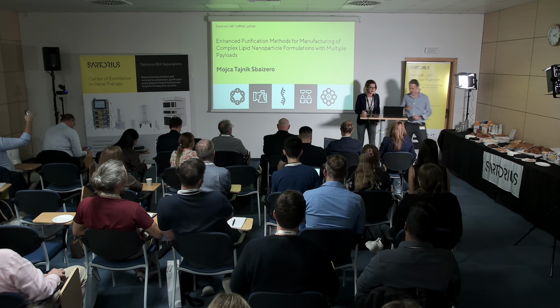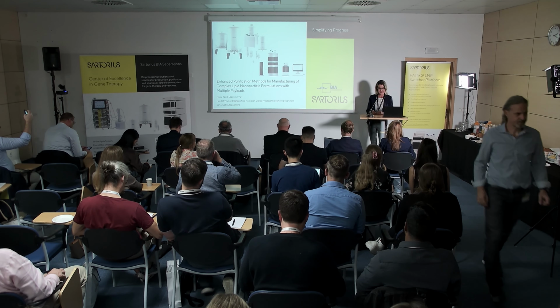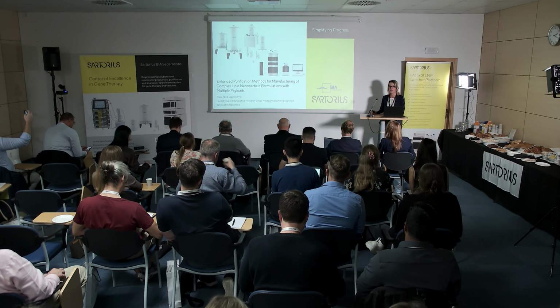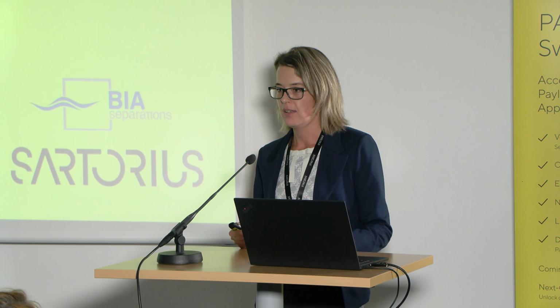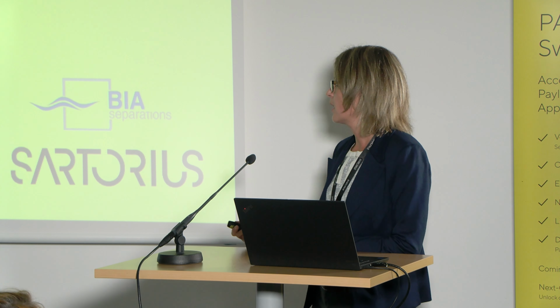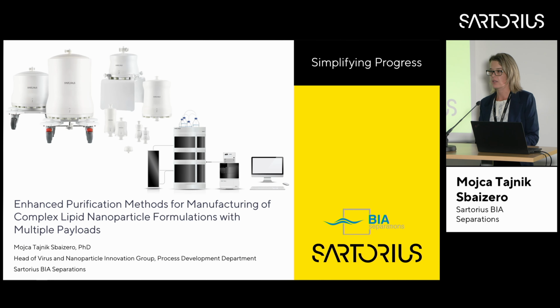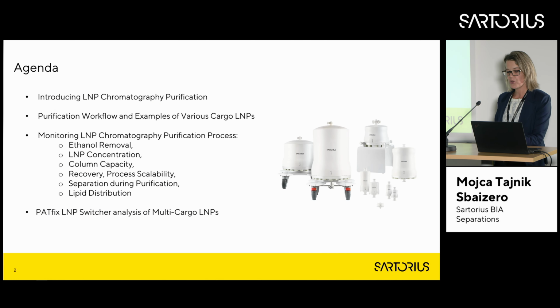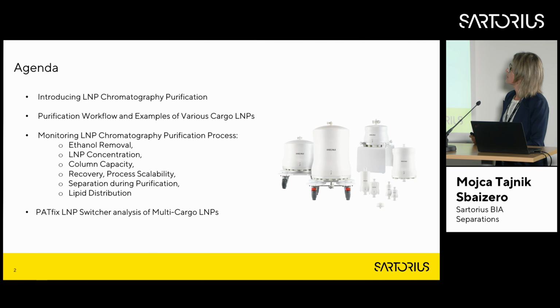Okay, good afternoon from my side. Thank you for the introduction and also describing my title. We will now move to the purification part of the LNP manufacturing. So I will show you a lot of examples we did so far in this building, and also how we combine this with the analytics approaches that were just presented by Tristan.